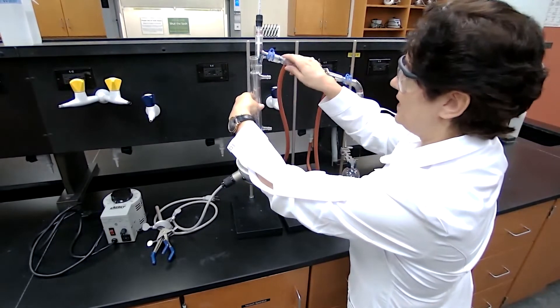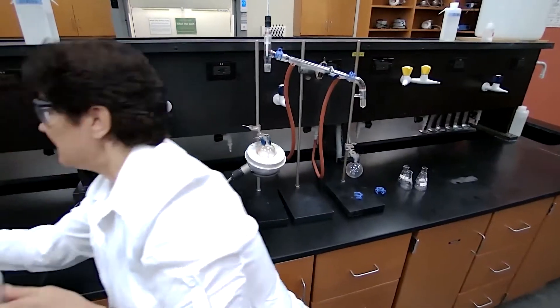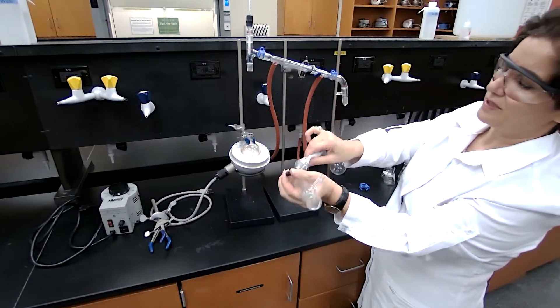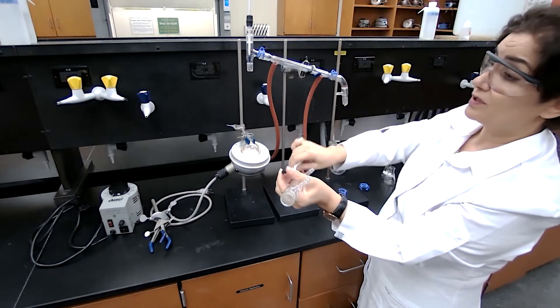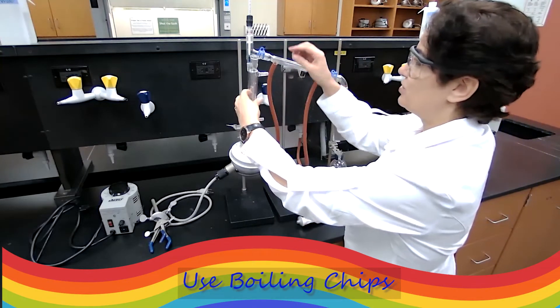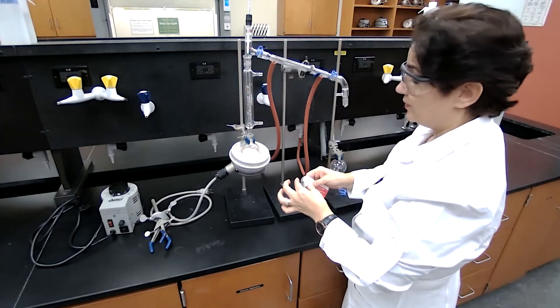Insert the fractionating column. Now don't forget to add the grease. Grease must be added to every glass joint for the same two reasons that we talked about in the other distillation setup. You want to make sure that your glass joints are always lightly greased.